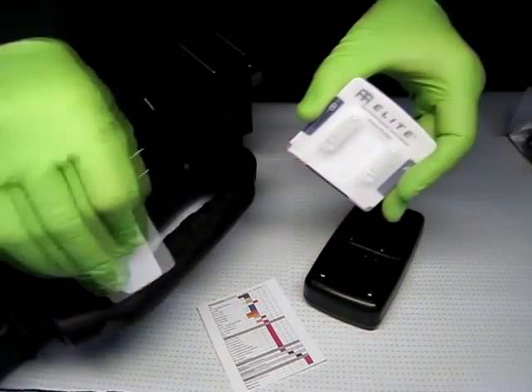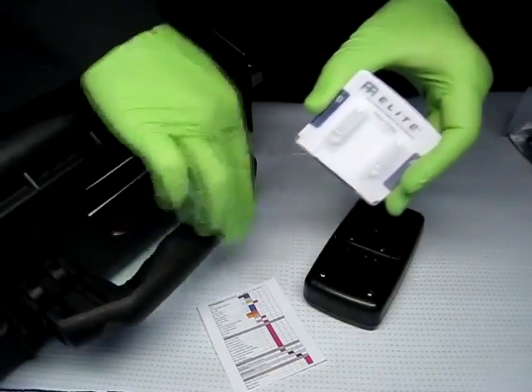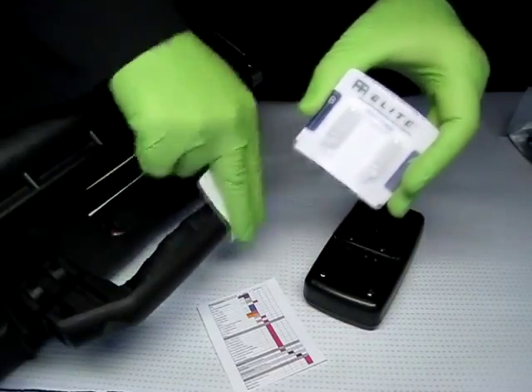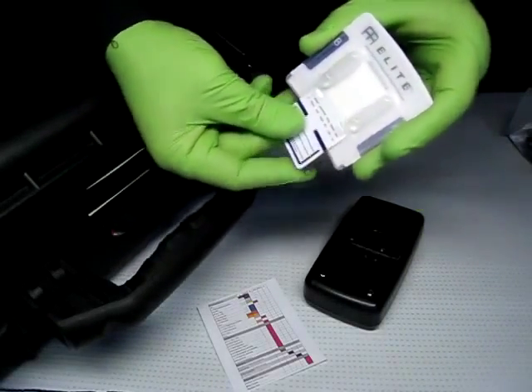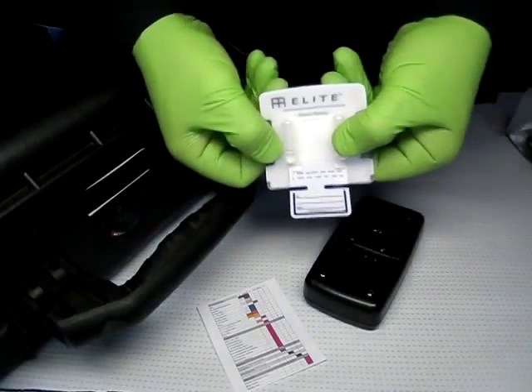Remove the testing unit from its packaging, take the swab from the testing unit and wipe the suspected surface as if cleaning it. Reinsert the swab into the body of the testing card and break the ampule.